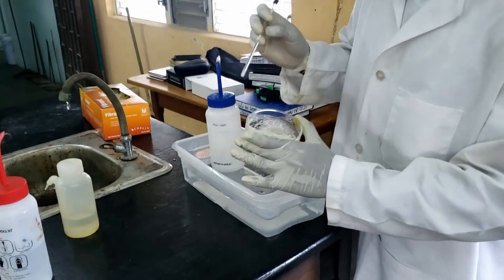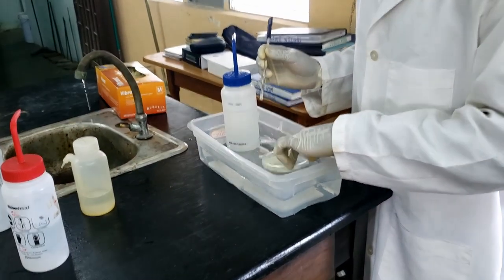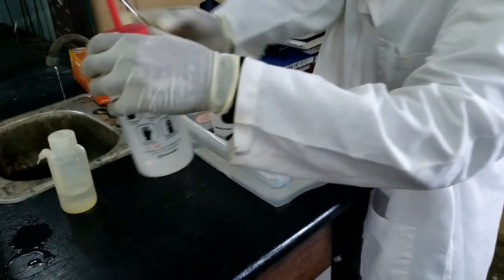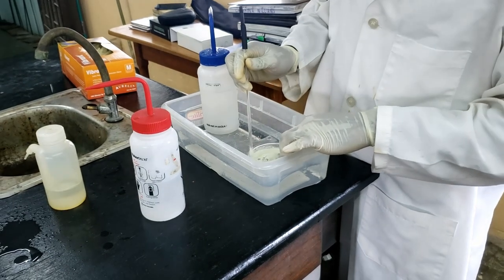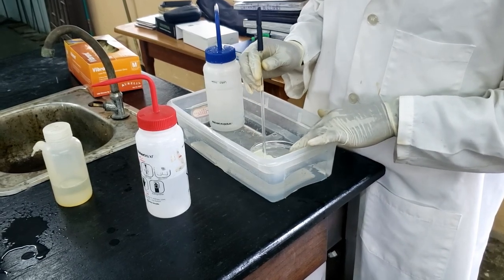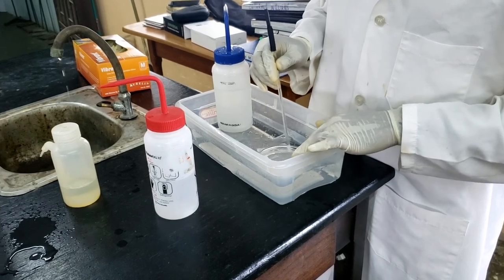So we have cooled down to room temperature. This is how the crystals look. Now I'm just going to cool on the ice bath for a bit. We go ahead and we start washing with some ice cold ethanol. Now all these recrystallizations are important. You want to make sure we get the purest product, and the O and the P bromonitrobenzene, they separate.